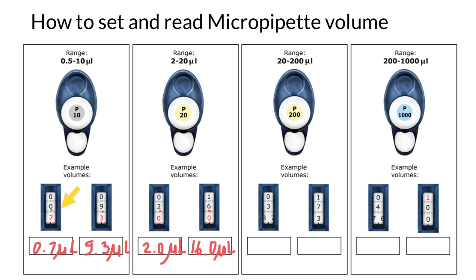Actually, we have seven on the right and eight on the left. It is not three, it is eight. So between seven and eight, we are going to get three, seven and a half. So here we have 37.5 microliters.